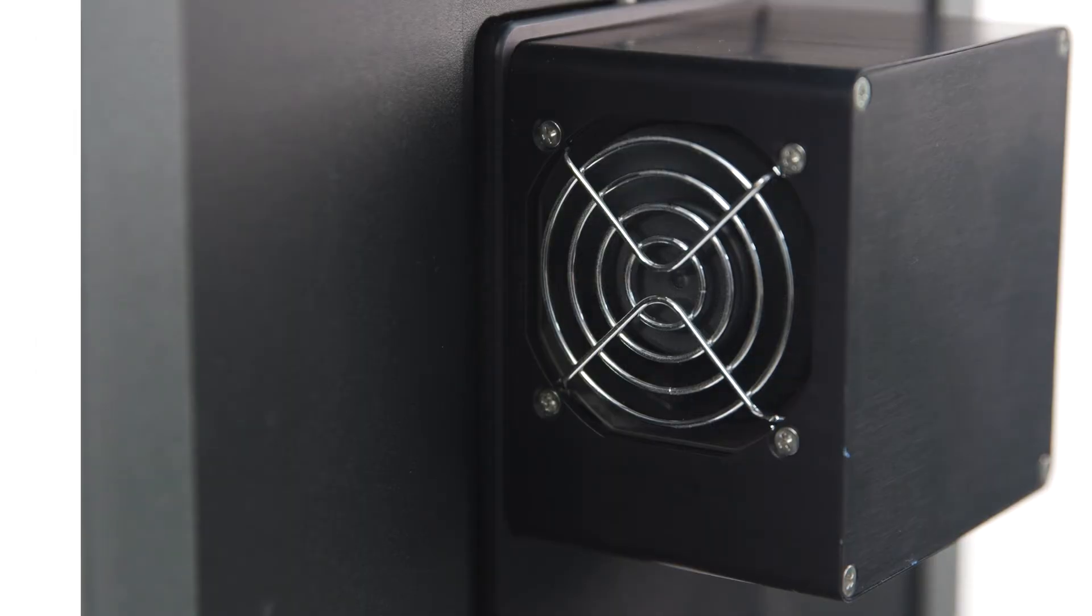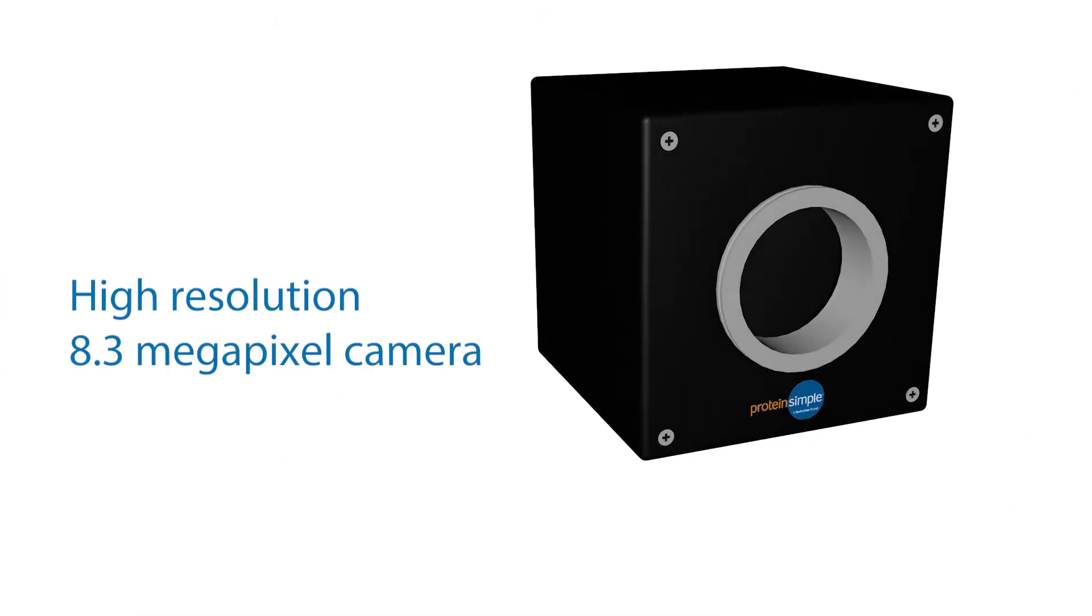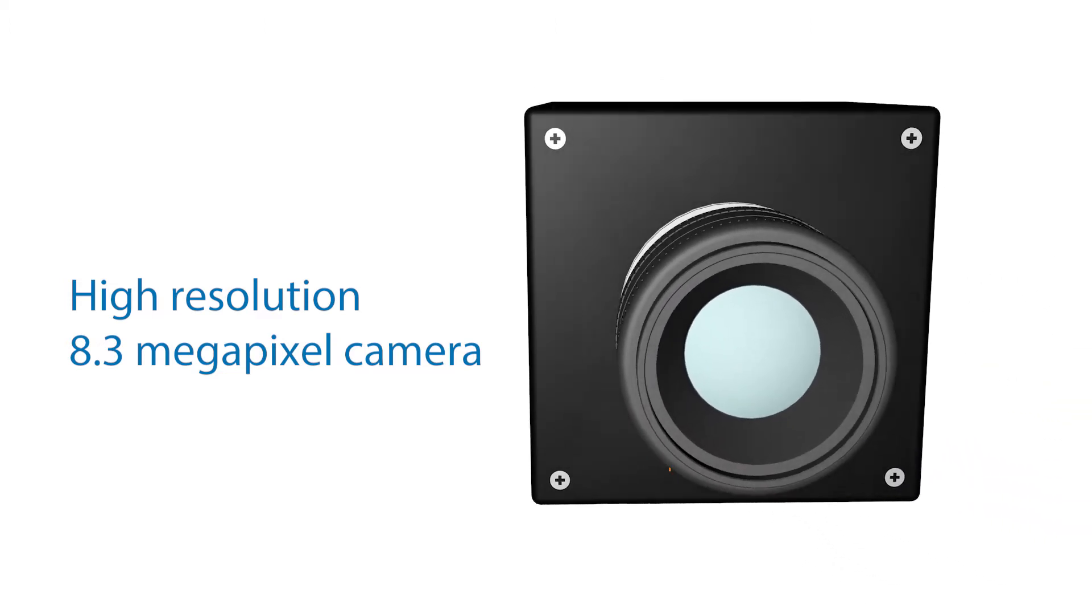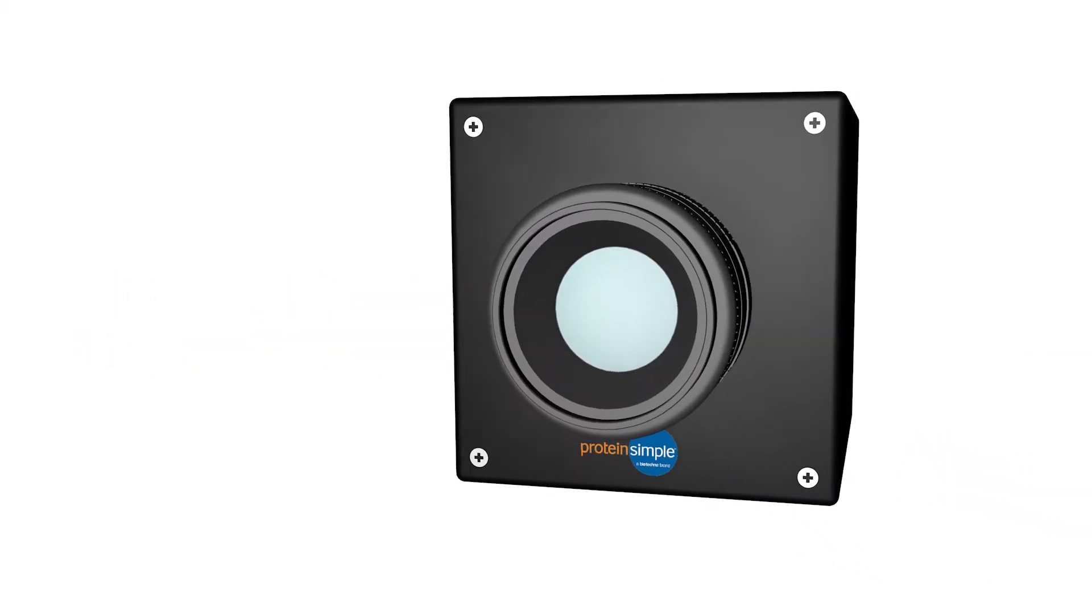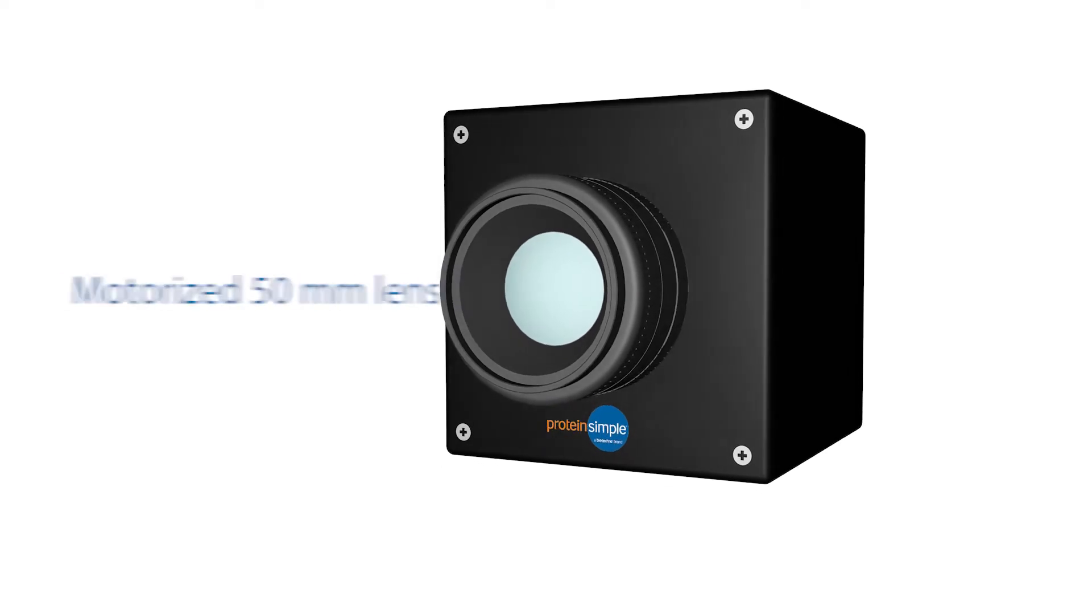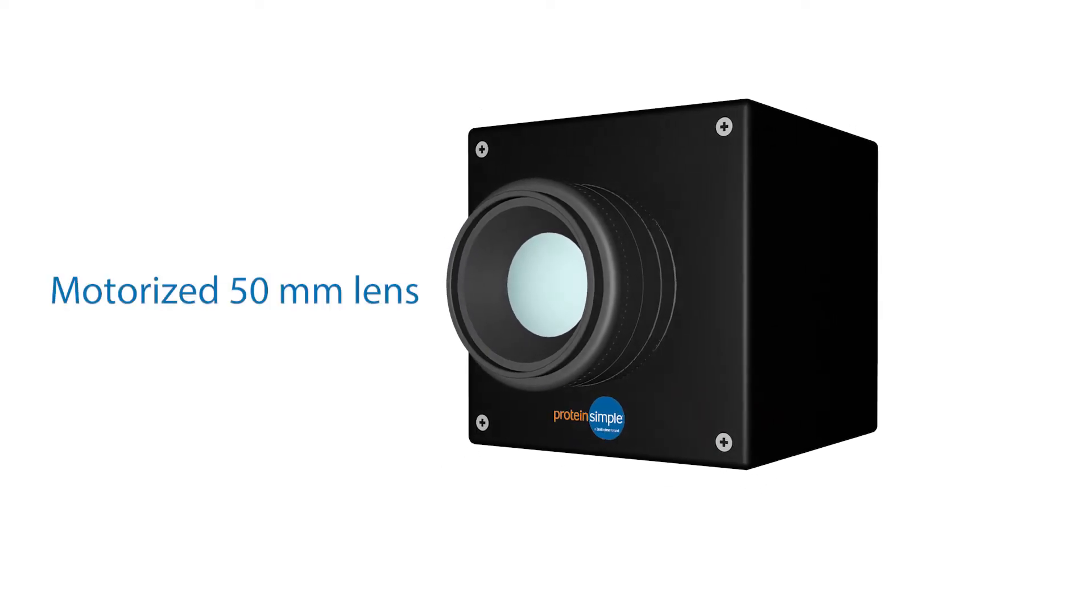On the back of the FluorChem Imager is the fan for the super-cooled CCD camera. This 8.3 megapixel camera provides the resolution and sensitivity that's the heart of the FluorChem Imagers, and it's paired with a motorized 50mm lens.